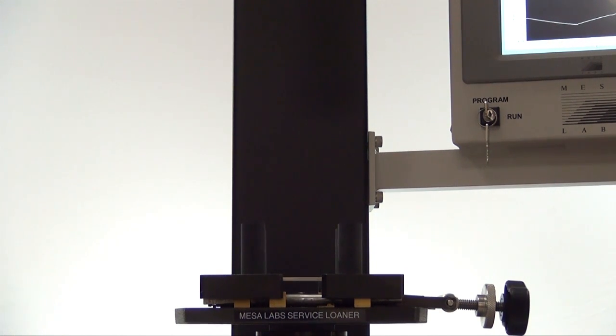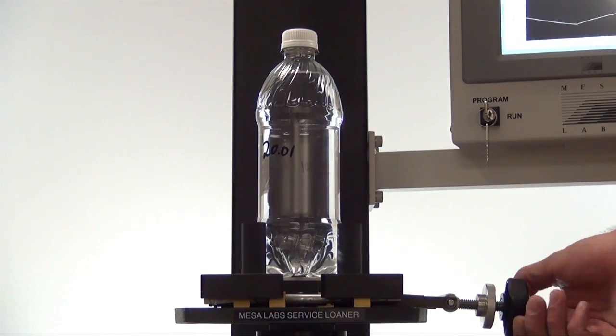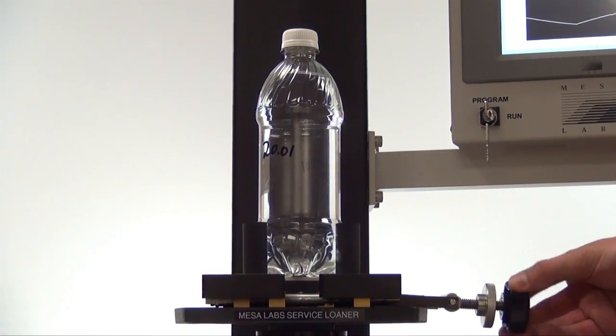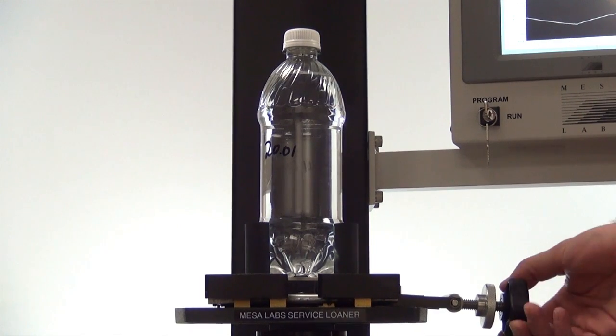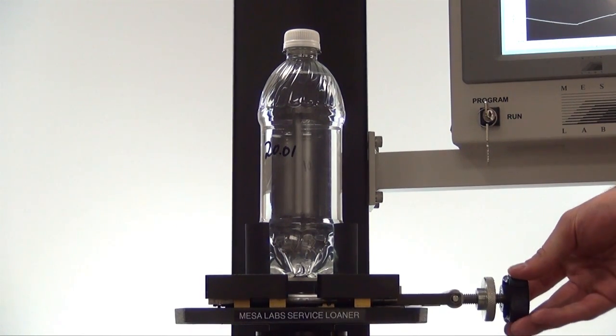Once you are at the main testing screen, you are now ready to place the product that you are going to test into the bottle holding fixture. Take the bottle, place it into the vise, tighten the vise by turning the lever clockwise. Once you have a firm grip on the product, you can now easily put bottles in and out by opening the lever.